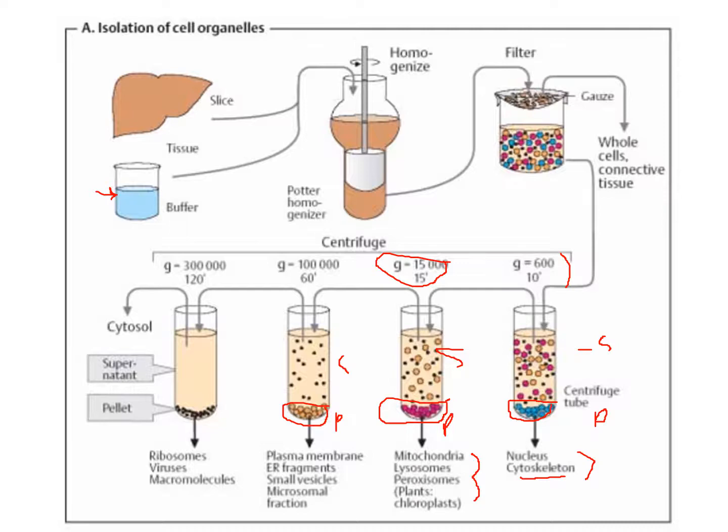SARC would probably be in there, and the proteins that SARC binds would be in there. Small vesicles, ribosomes, microsomal fractions, maybe small organelle bits, and then eventually ultracentrifuge 300,000 g for 2 hours, maybe longer.